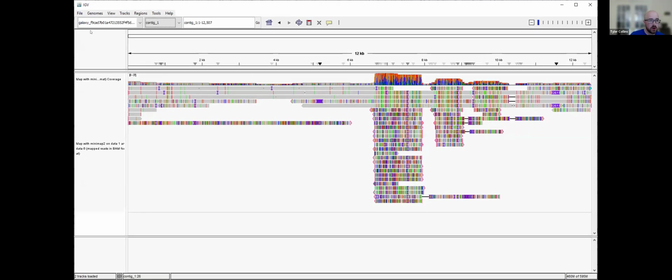Up here at the top, you'll see where it says Galaxy and then all the random jumps and letters. This is going to be our contigs that we generated. And you'll see we have access to all of them. They're ordered in the programmatic way, not necessarily the regular human counting way, but you can search through all of them and every single one will be present in here.